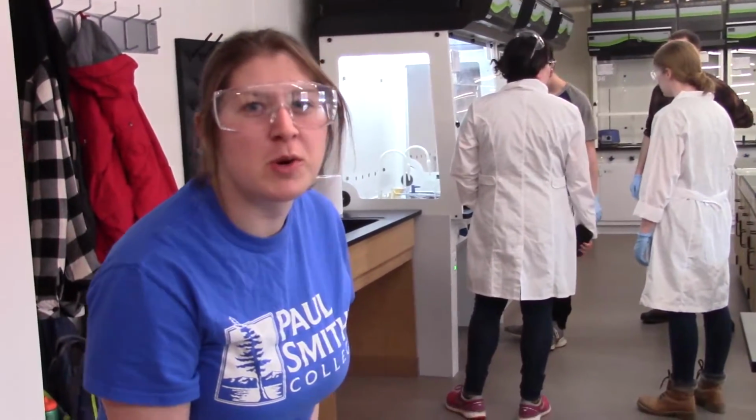They're preparing for a reaction. They're about to do an experiment. Let's go see what they're doing.